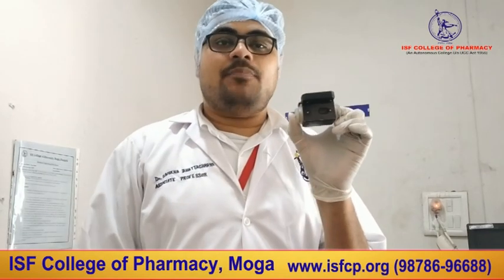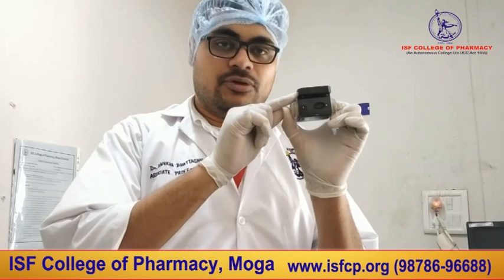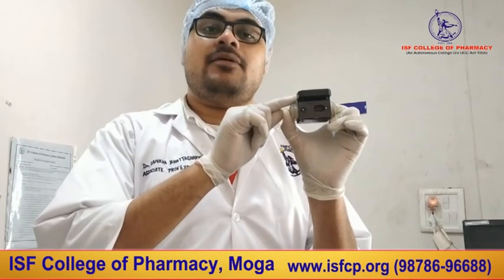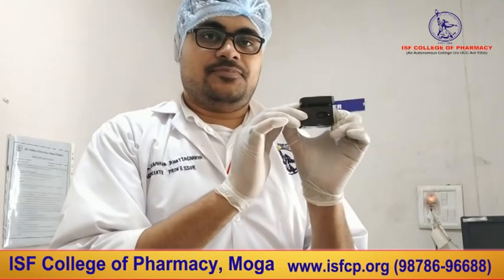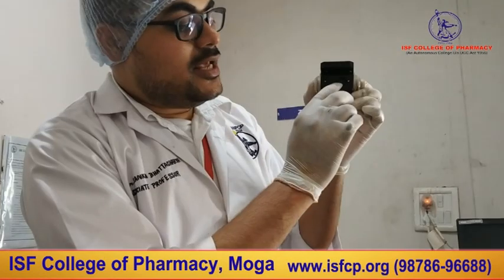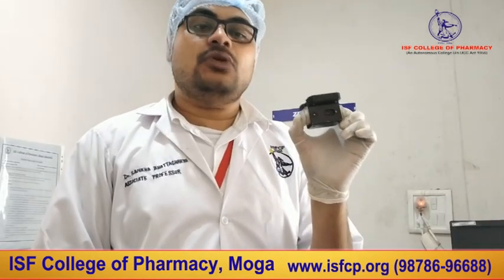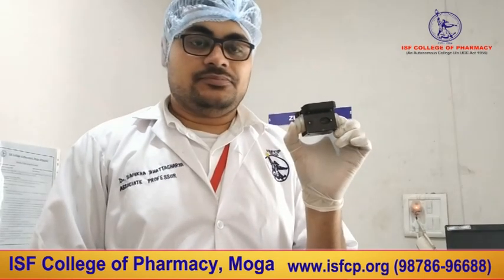The most important part is that once we pour the liquid, water or nano-emulsion over here, it has to maintain a proper balance or level from the left hand side to the right hand side. Make sure there should not be any kind of bubble formation during this process. If any bubble forms, then you may not get a proper zeta potential.